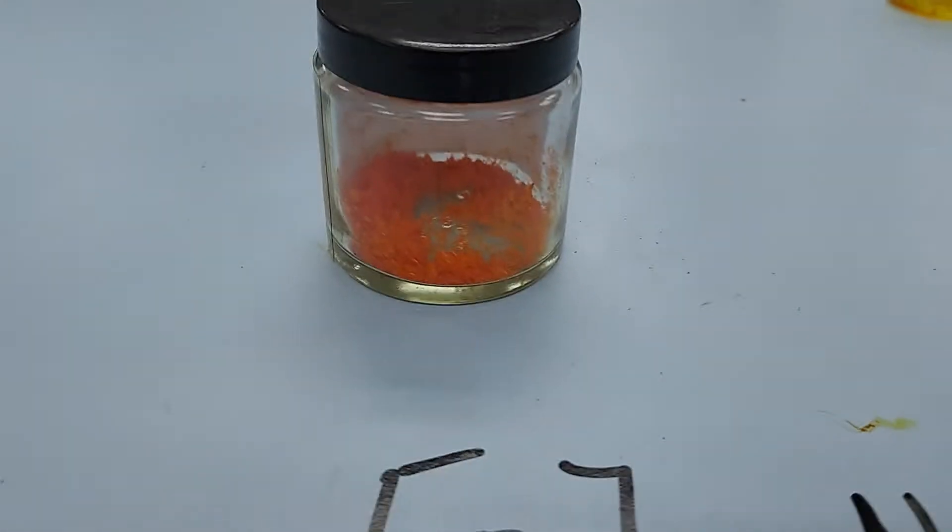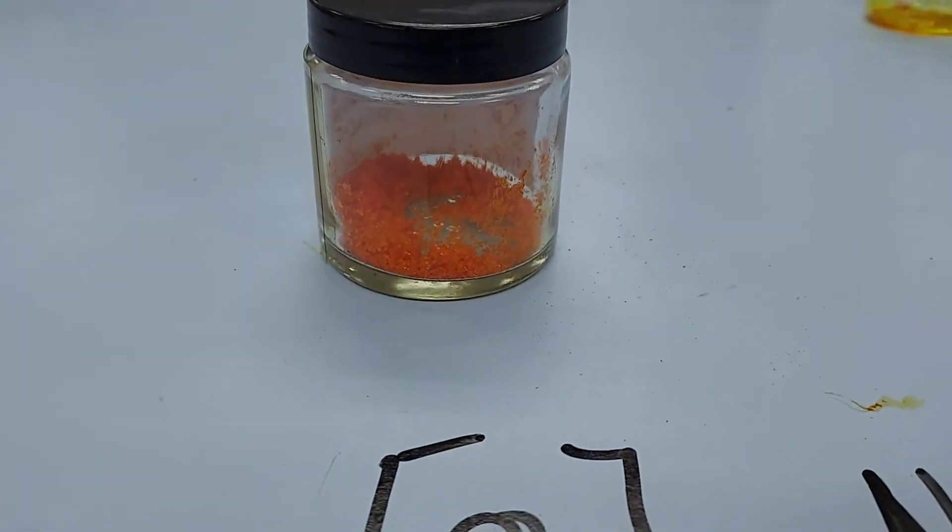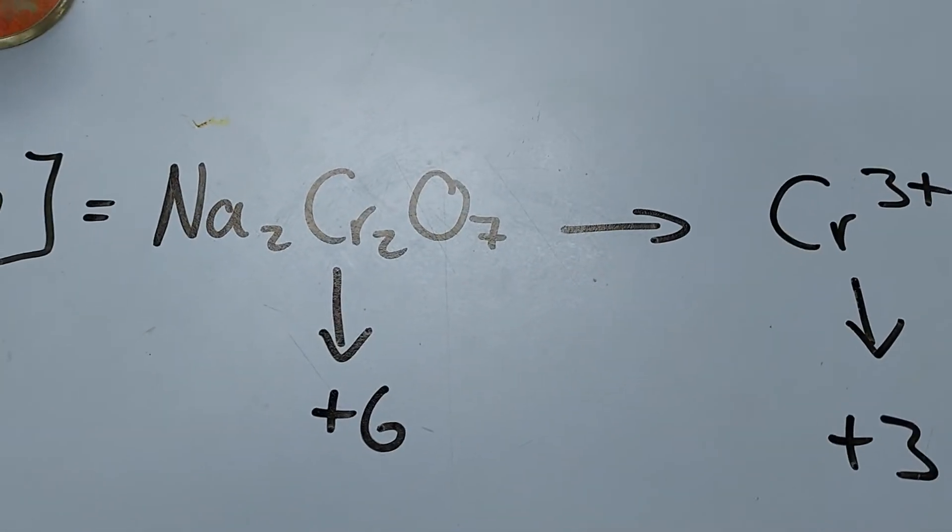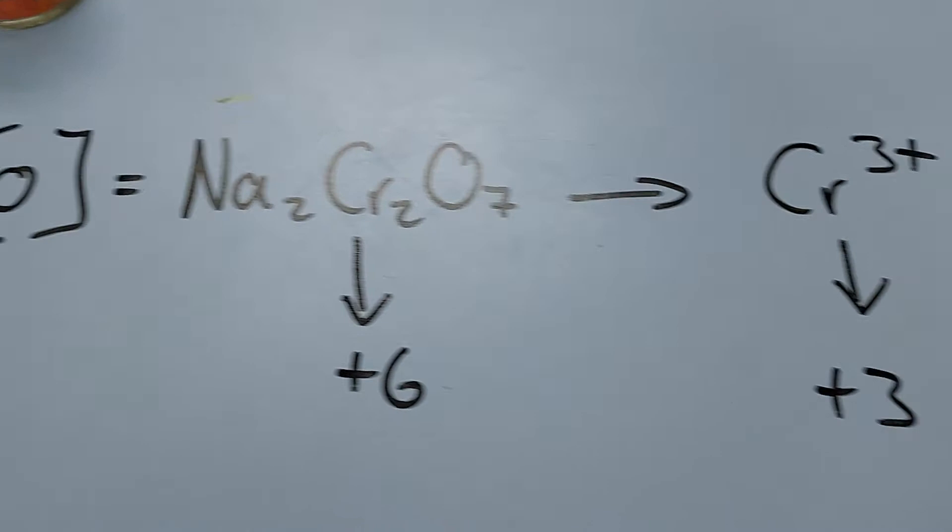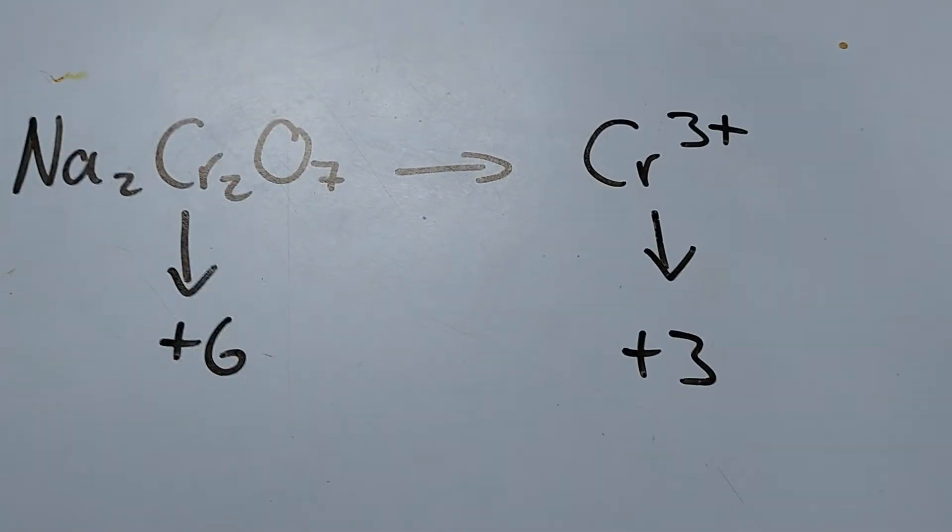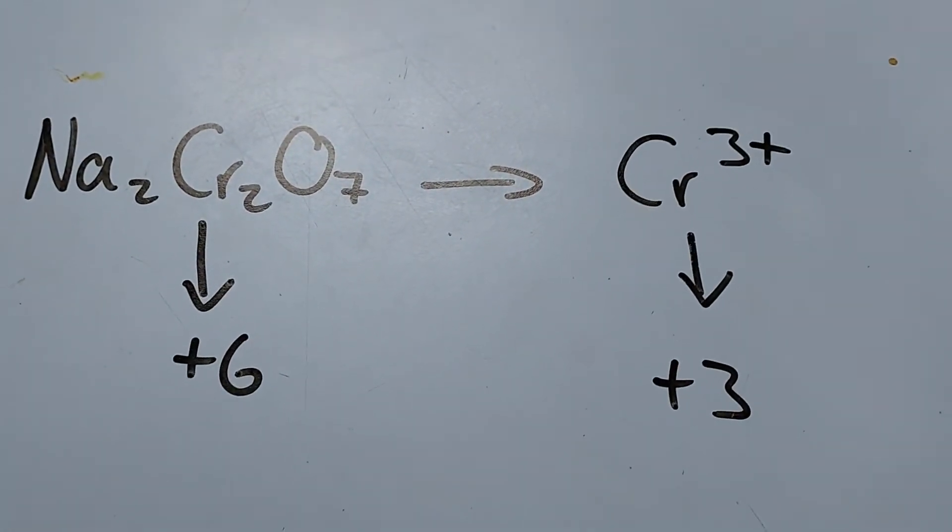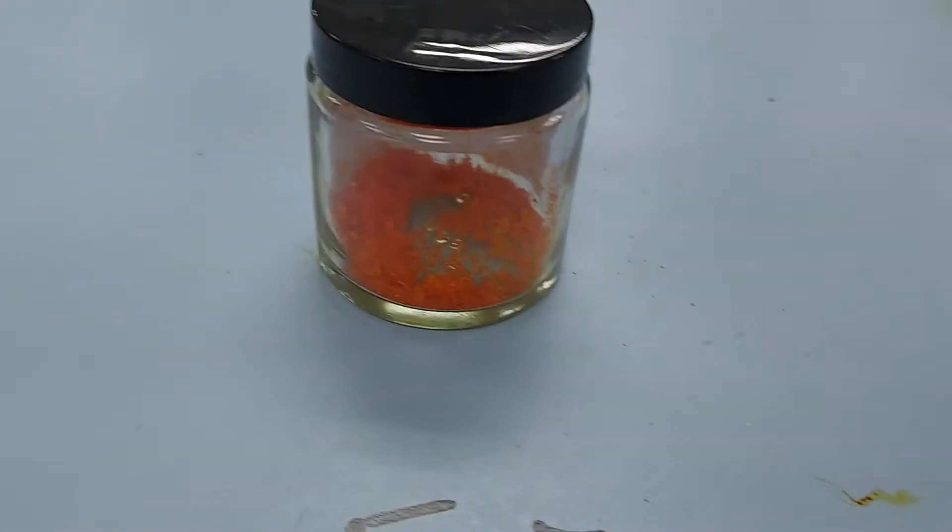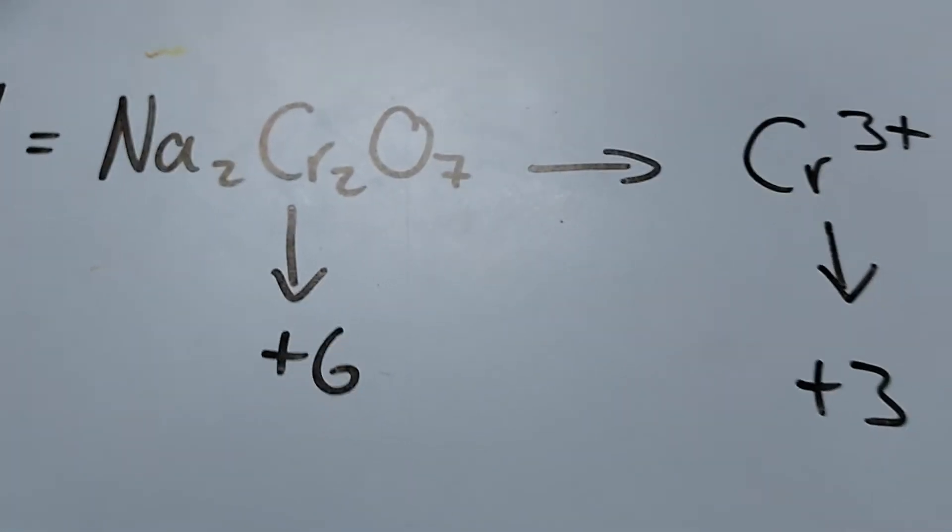What you should notice is a colour change. Here's our sodium dichromate. In the oxidation, the chromium is in the oxidation state plus 6. It will be reduced to plus 3 when it oxidises the alcohol. So we should see it go from this lovely orange colour to a green if it works.